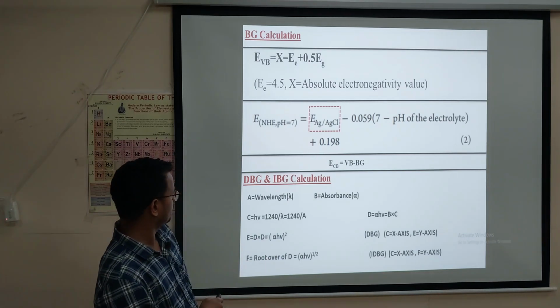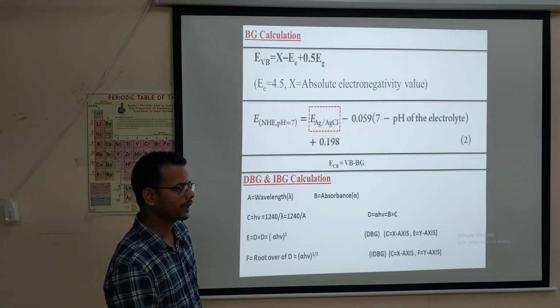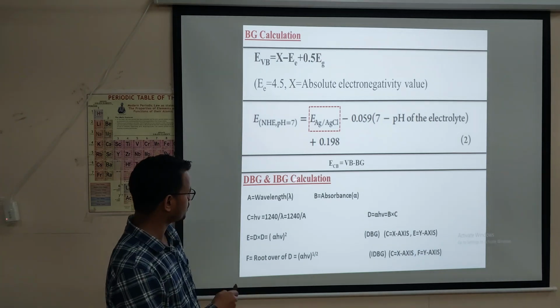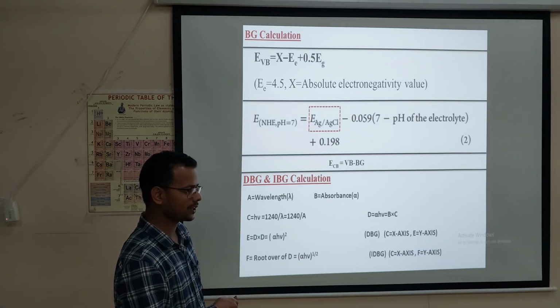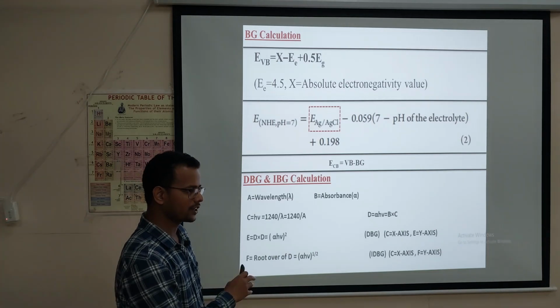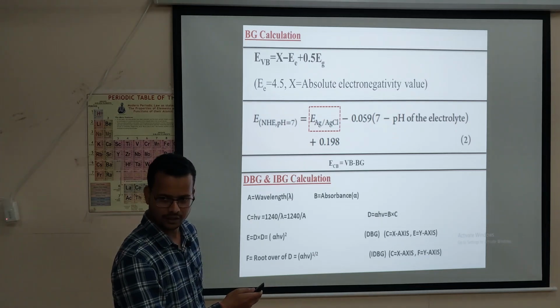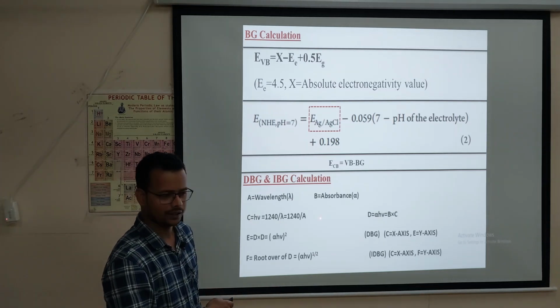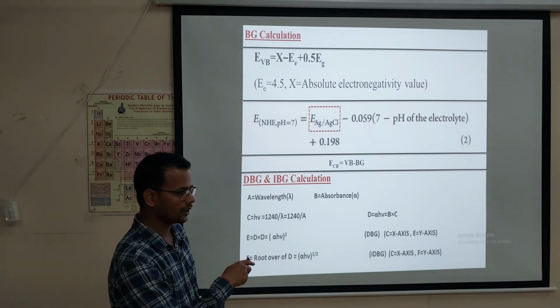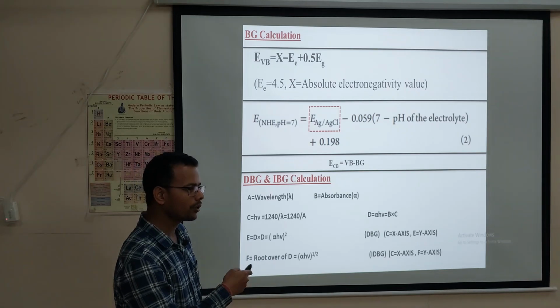You know, here direct and indirect band, you know one thing. It's okay, 5 more minutes, I will complete it. This one was actually very important, because we have to follow this to calculate the band gap. We will discuss it later, not now, because you are late now. How to calculate direct and indirect band gap. This slide is very important. Among all this, that was the fundamental. This is the practical part which we will apply.